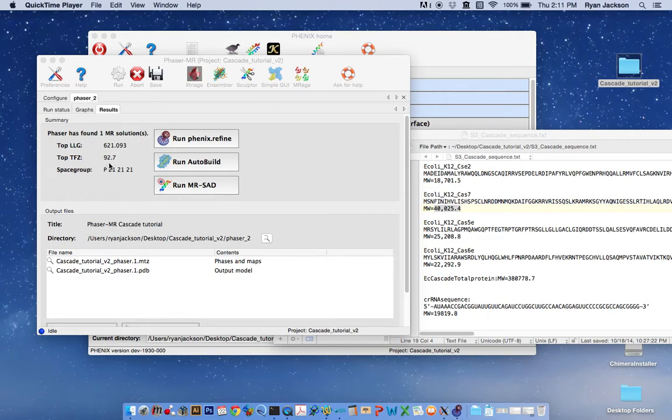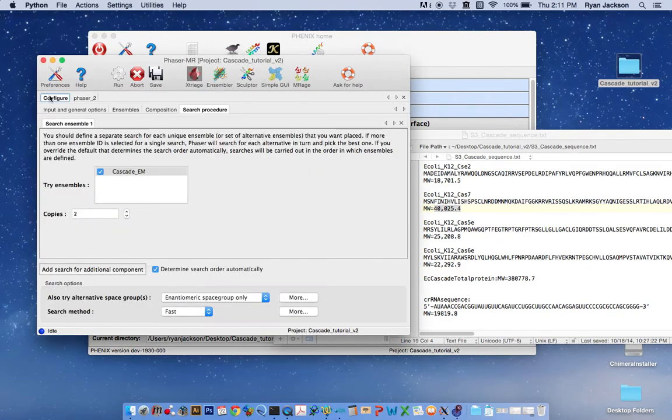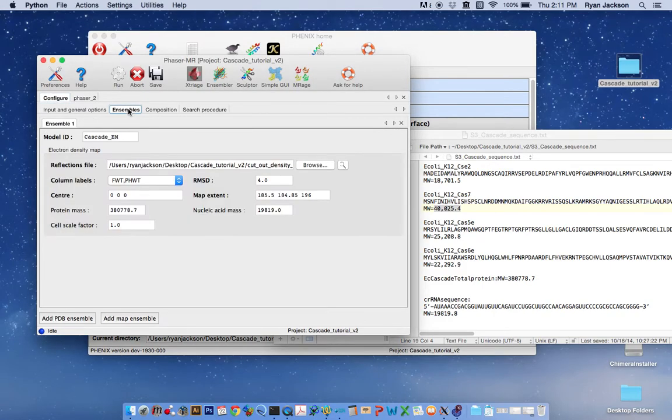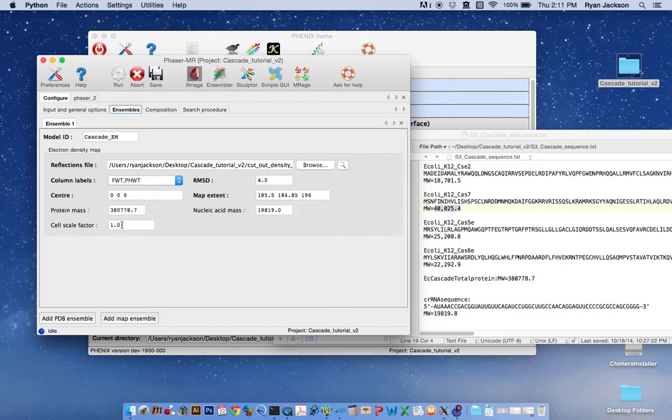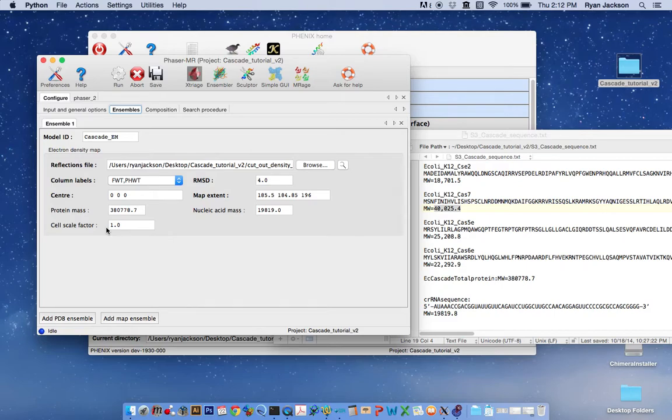If the TFZ score is low, if it's not above eight, there are a few things you might try. You can go back to the ensemble panel and you could change the original scale factor from one to something else, usually we recommend going in increments of 0.03. So you could try 0.97 or 1.03. Basically what we're suggesting here is that your original map, the scale is not correct and it needs to be modified a little bit to get a good solution.